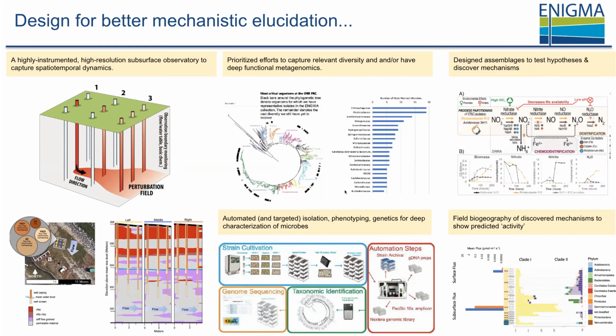Once we have scored important microbes from the biogeochemical point of view and the ecological point of view out here, and we have their genomes and their characterizations, we can prioritize those for creation of synthetic communities that are simulations of what we observe in the field, or are designed to prove a principle of what we observe in the field. Now, we're interested in nitrate reduction and the coupling of nitrate reduction amongst community members. And so what we'll be showing you is this idea that we can pick these microbes out, assemble them, and begin to measure how they operate and predict how they'll operate using KBase functionalities.